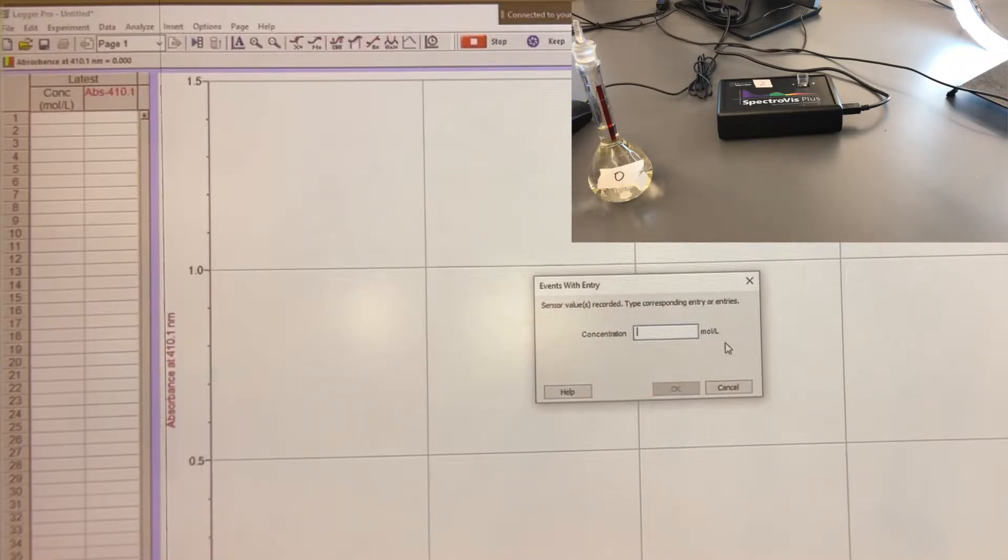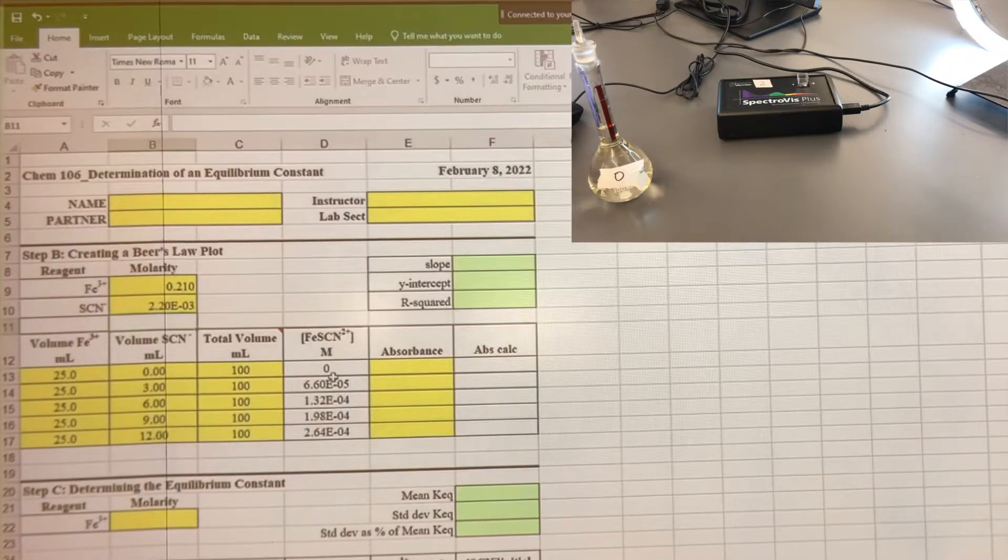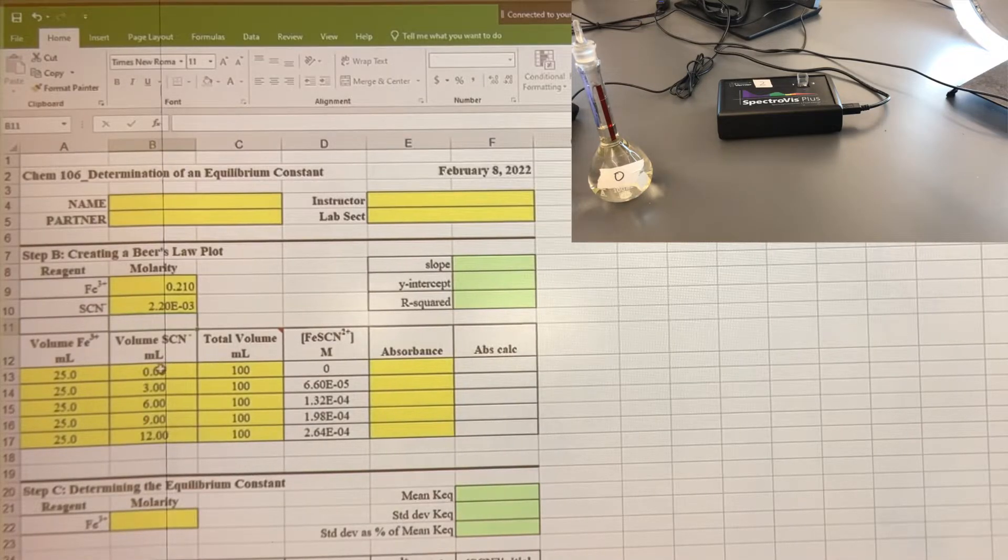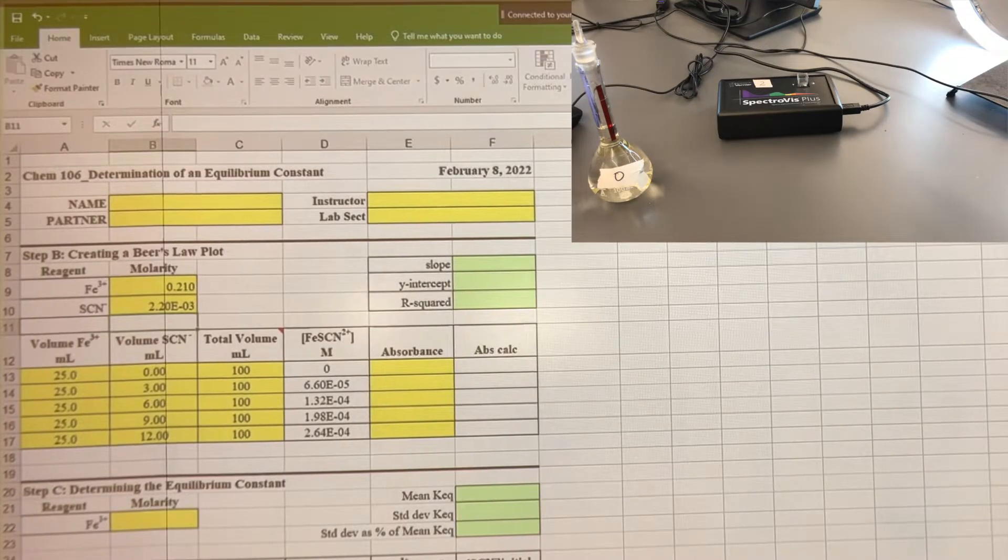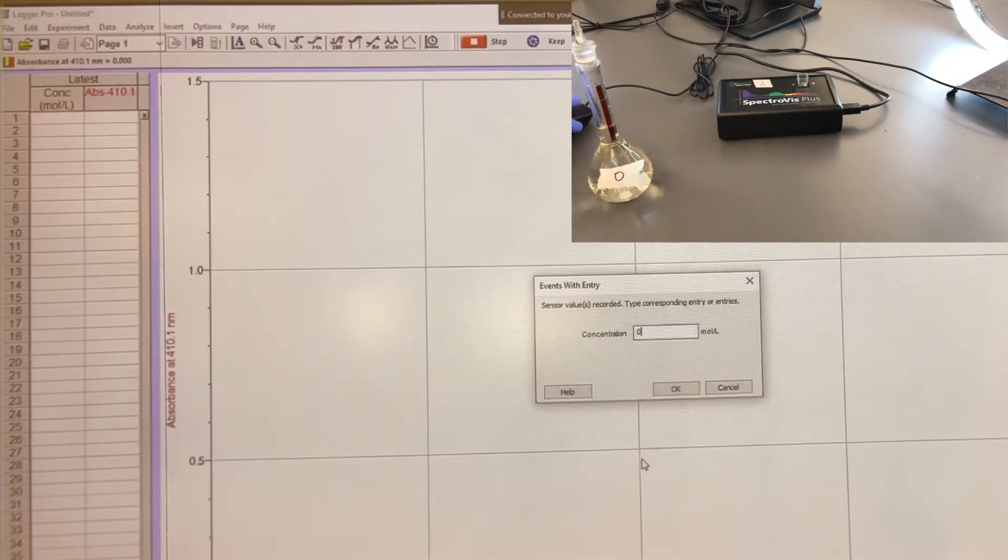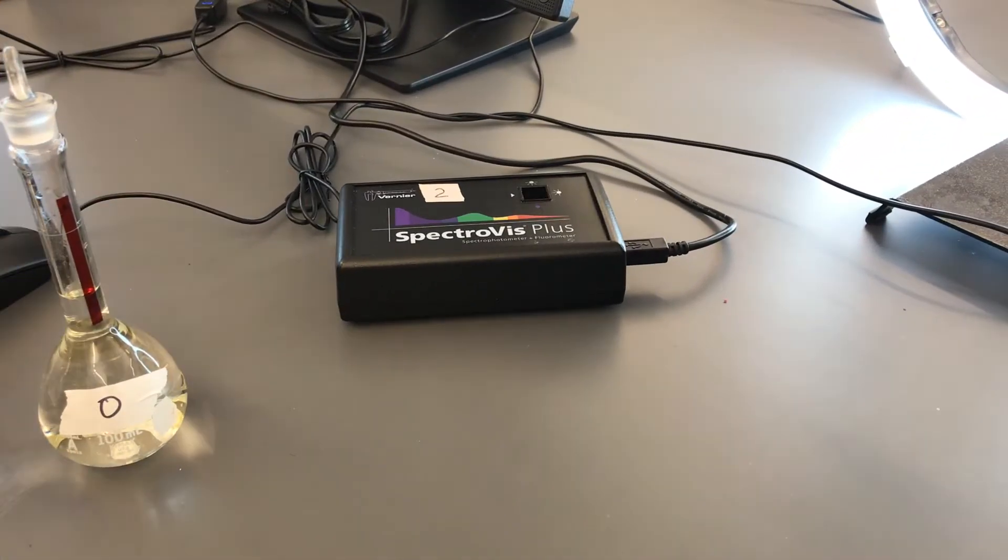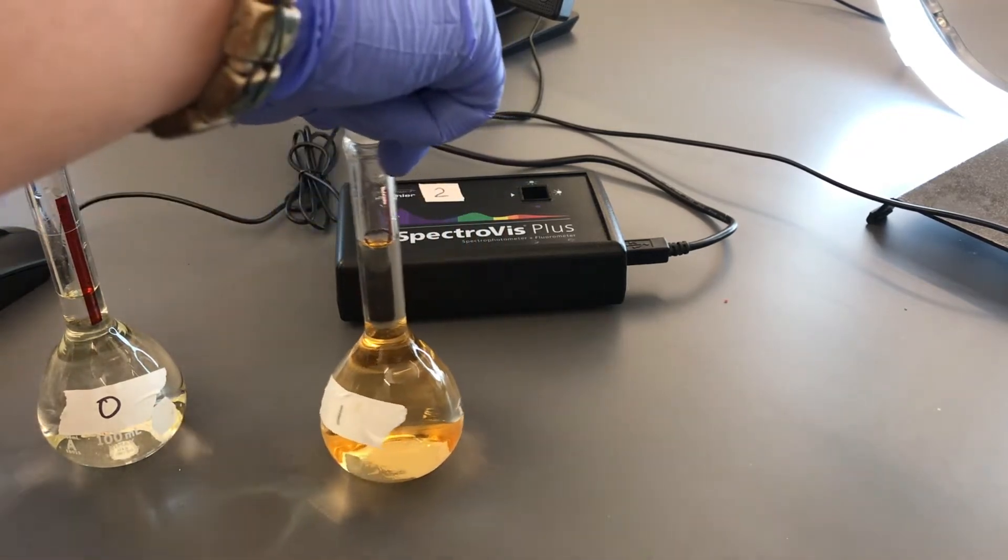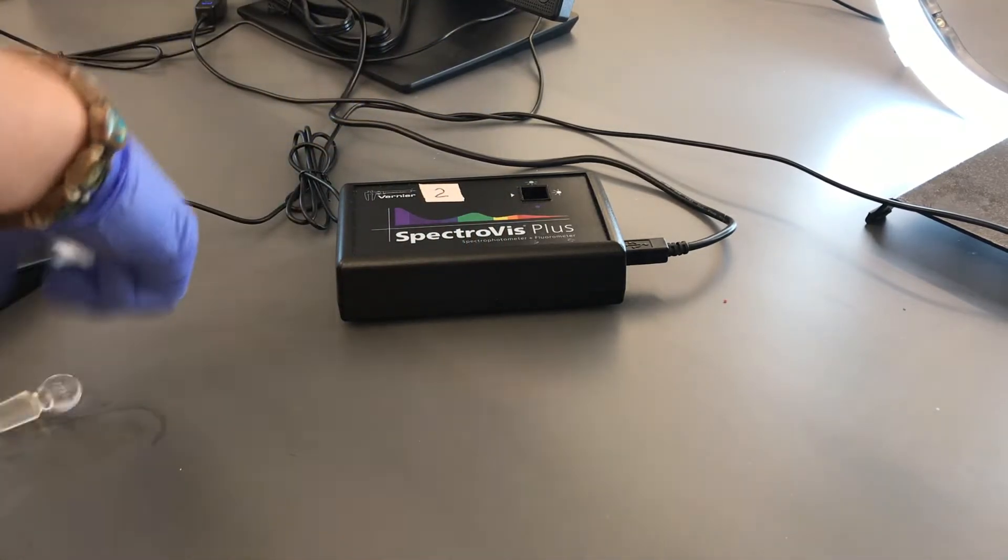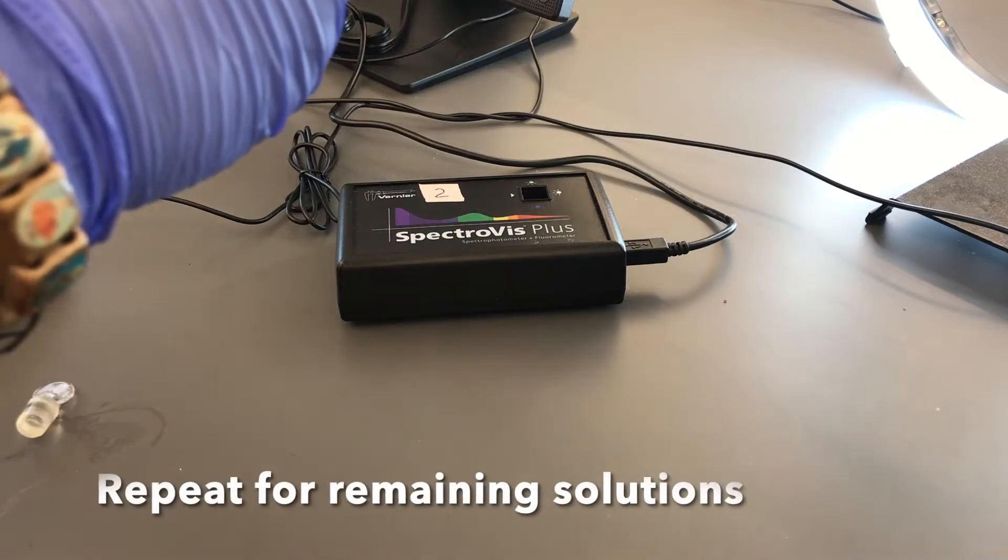Concentration of this solution, of the complex that was formed, is 0 because we didn't put any sodium thiocyanate in there. There's no complex that formed with that iron. So it's 0. That'll be our first one. And then we get a new fresh cuvette so that we can do our number 1. And we'll essentially keep each of our absorbance values.